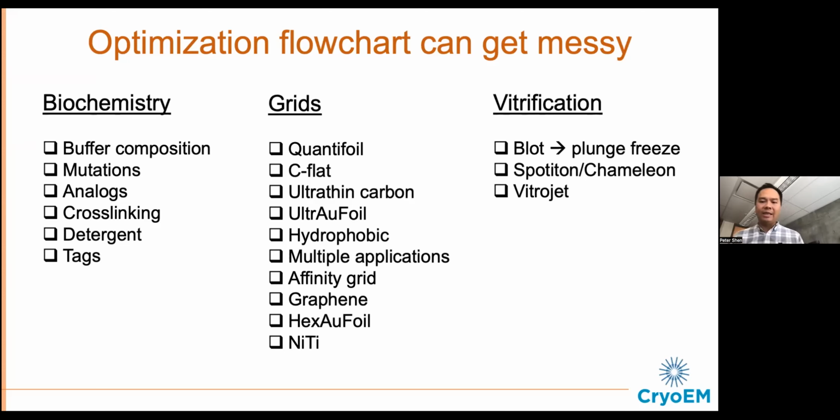Each grid has to be examined individually. And I think that's really just the tough reality of where we are currently as a field. And all of the latest bells and whistles in microscope hardware and image processing software won't be helpful if we're bottlenecked by screening.